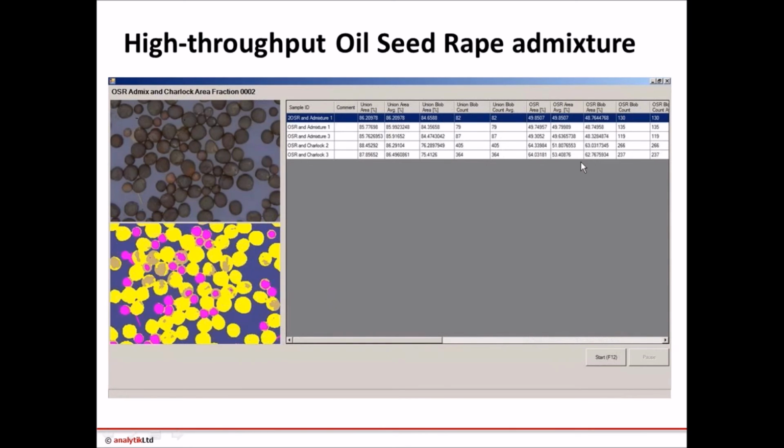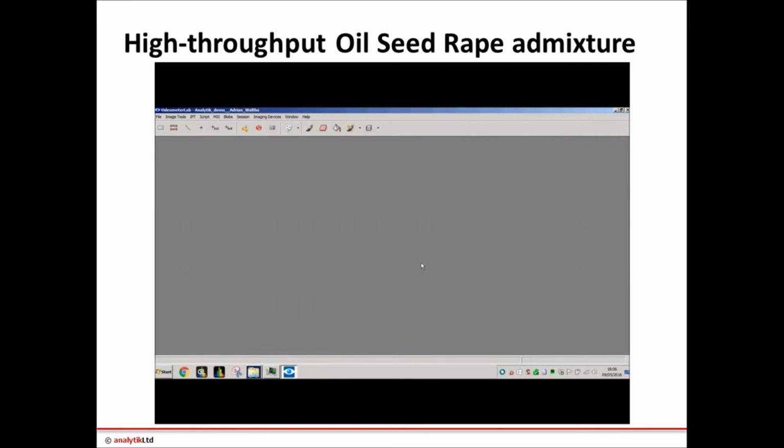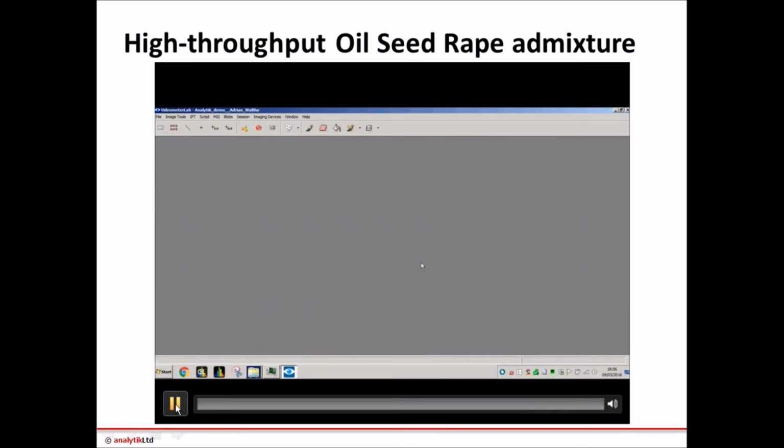And I've just got a very short video here of the session, one of the session models in action. I've sped this up by 2 times, so this is twice the speed it normally goes at, and it's actually just looking at a folder full of images I already have, rather than taking images live from a VideometerLab, but that is of course what you can do. I'll just press play here.